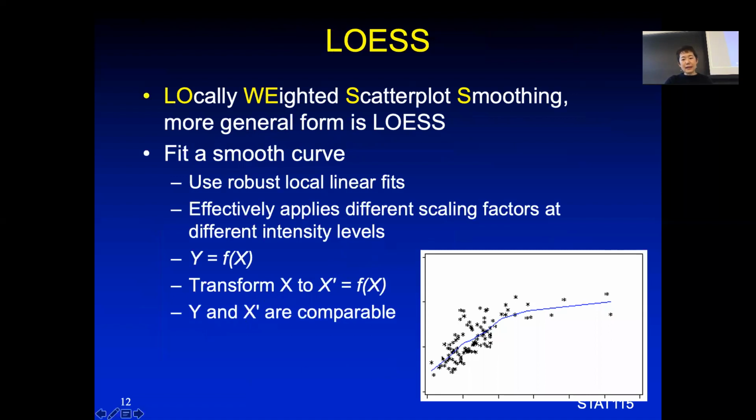However, sometimes you might see cases like this. It's not linear. There might be some signal plateauing at a certain level, where the signal is really bright. The yellow has already reached a plateau. You can't get better signal on this one sample, but the other sample keeps going higher. So how do we normalize that? There is an algorithm called LOESS. You can weight or not weight, either way, it's kind of similar.